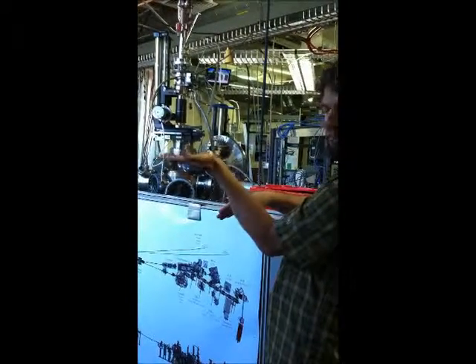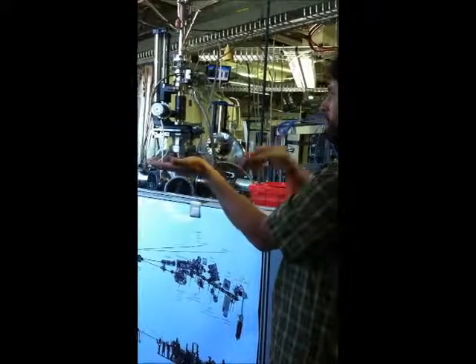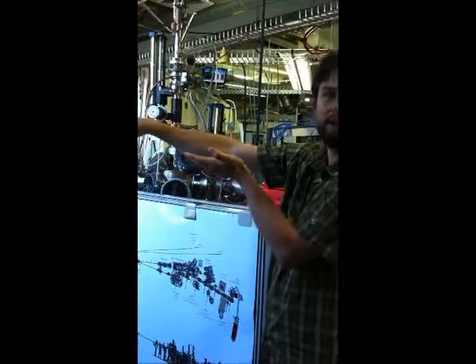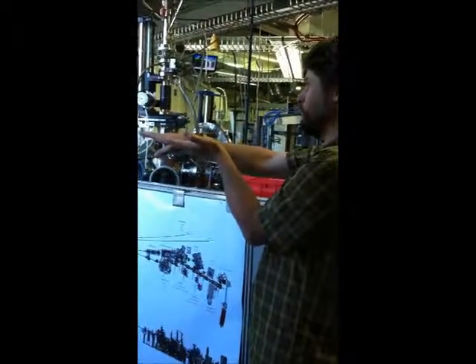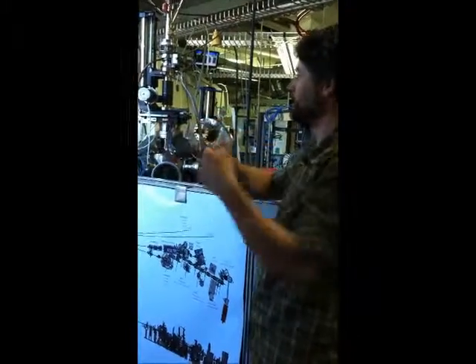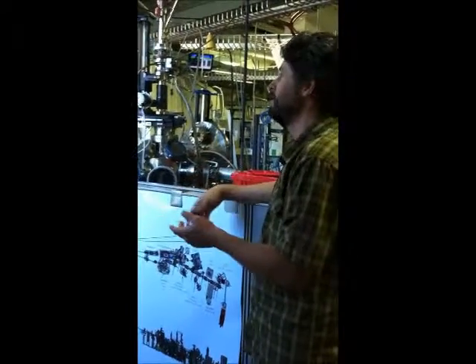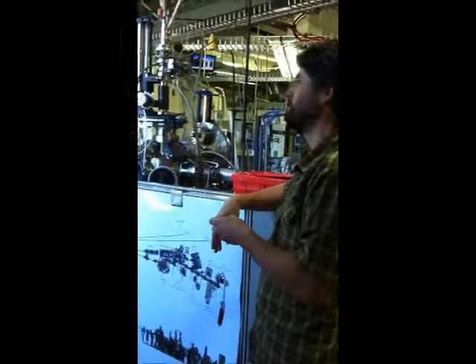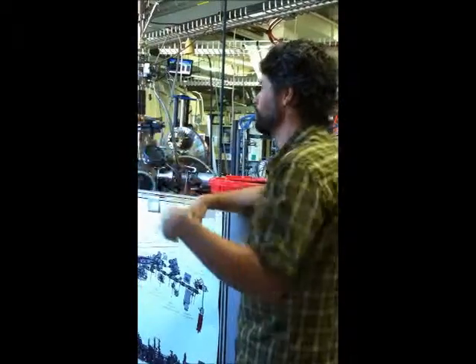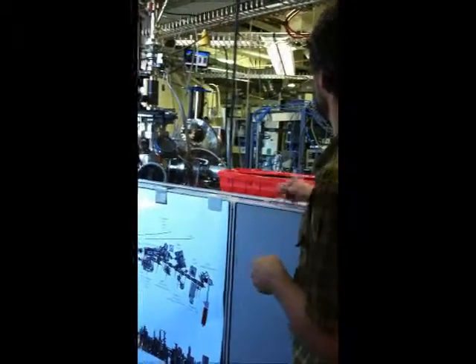If you take that really flat surface and slightly bend it, you can create a parabolic mirror. So the X-rays coming in are actually focused as they go off. And then think about it, you have such a flat angle coming in and a flat angle going off, and you're trying to focus the beam. You need a lot of horizontal distance for that focus to actually resolve in anything meaningful. So that's why beamlines tend to be long. And we have beamlines where they're thinking about punching holes in the exterior wall and building a whole other room to make another beamline. So that's one thing about experiments.